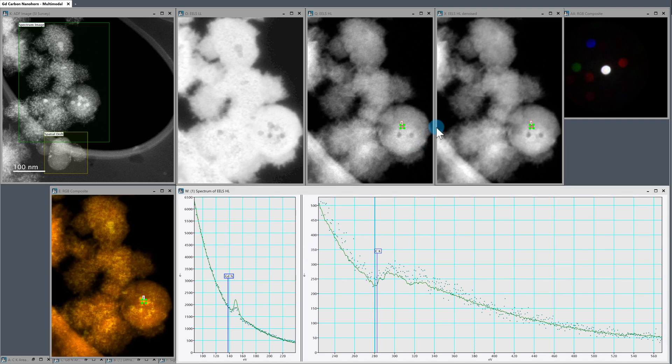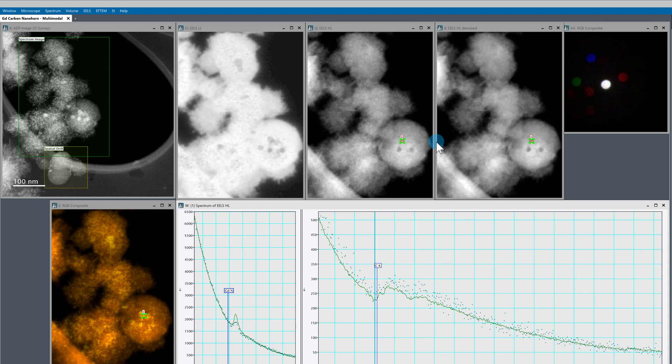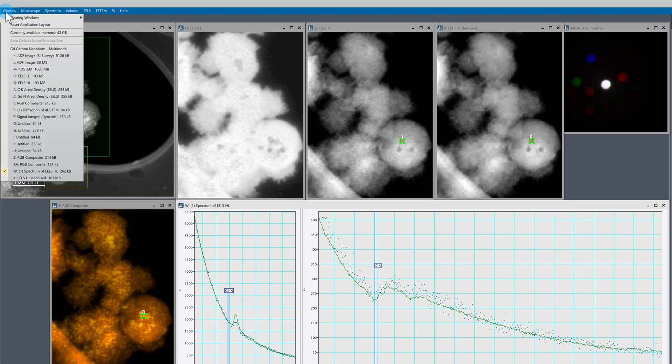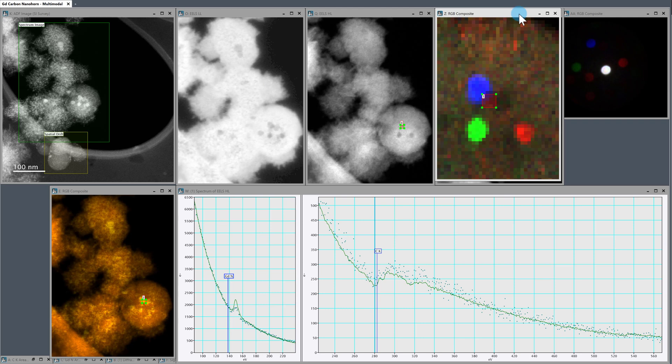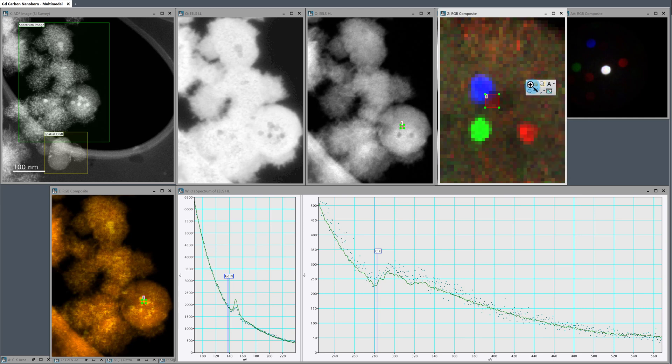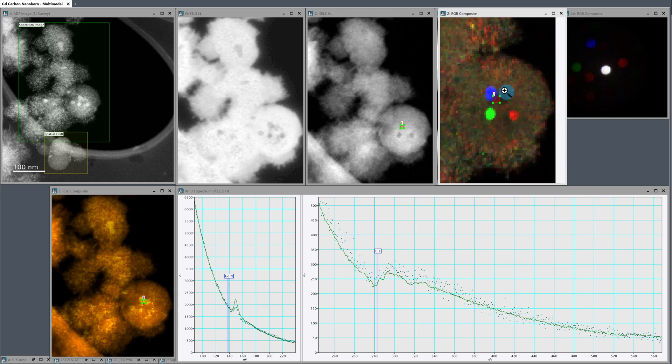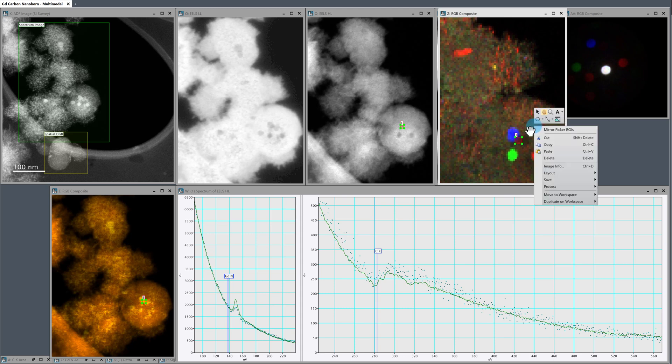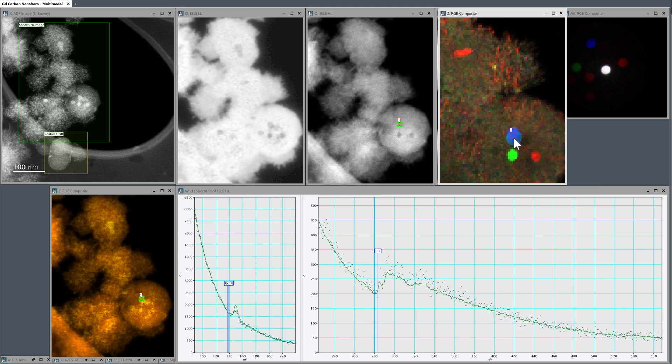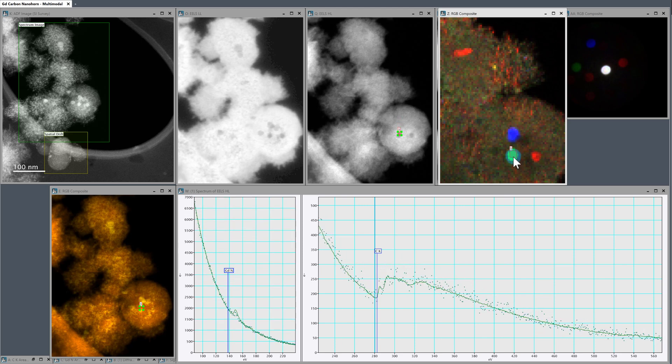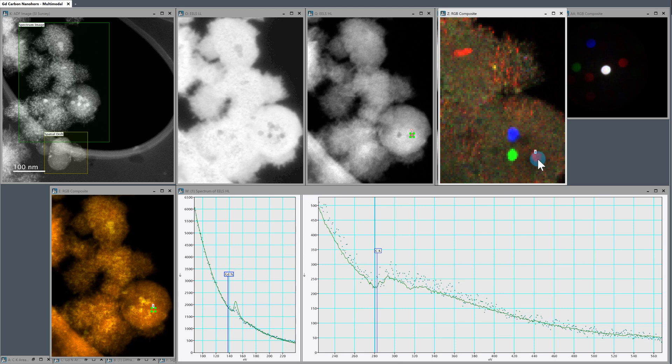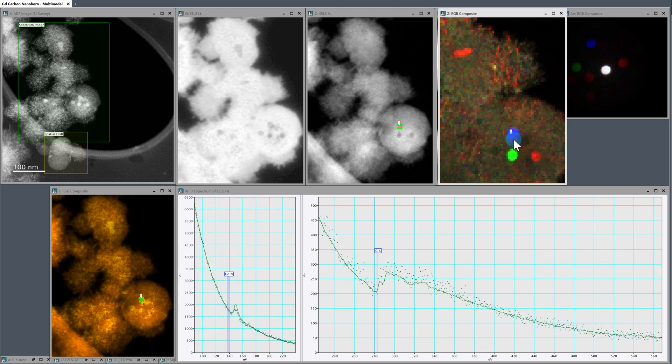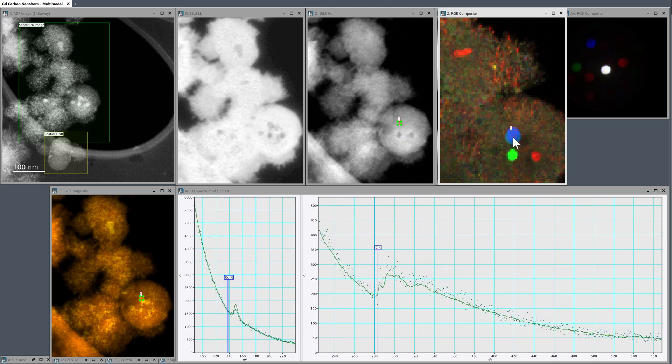So the final thing that would be nice to do is to go back to that composite from the diffraction data. So we'll just go to Windows. I remember that it was image Z. So we'll pull that up. And again, we're still linked everywhere. So we can zoom out just a touch and move down there. Remember, the whole goal is to check these areas. So check this particle A versus particle B versus particle C.